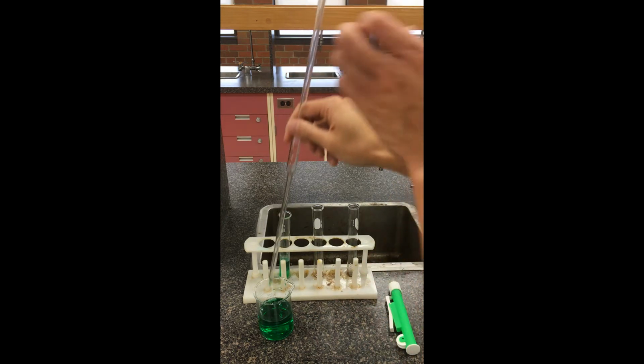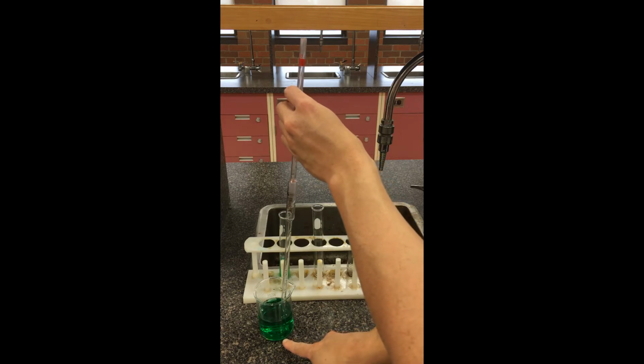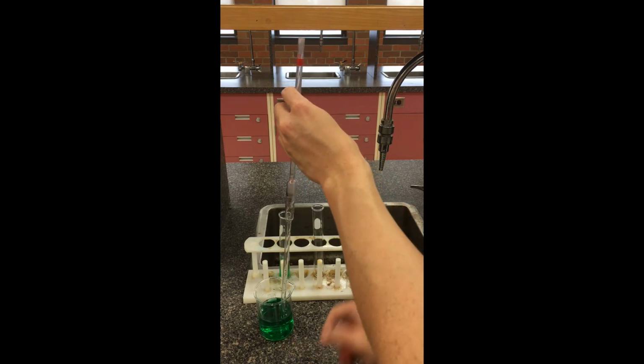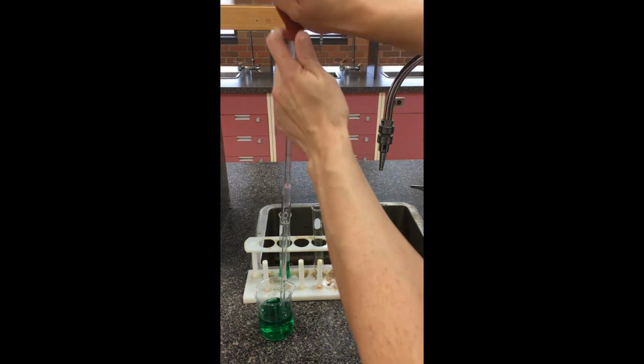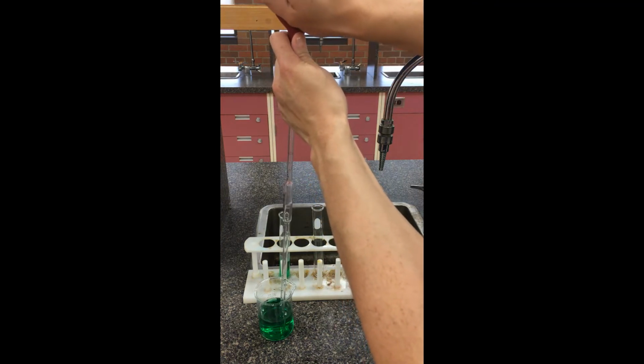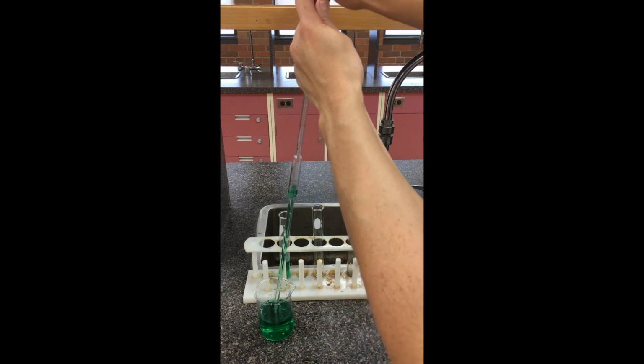Okay, let me demonstrate this once more. You take your bulb, and make sure this open end stays below the solution at all times. I'll show you what happens if we don't. So give the bulb a squeeze first. Let's say I form that tight seal. The solution is steadily coming up as I would want, but then let's say you're distracted and you start pulling it out of the solution.